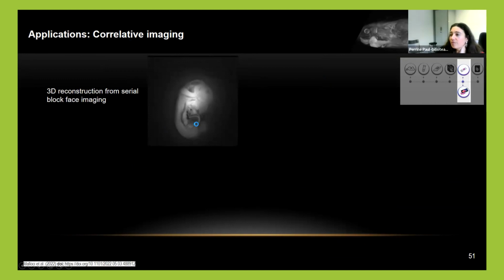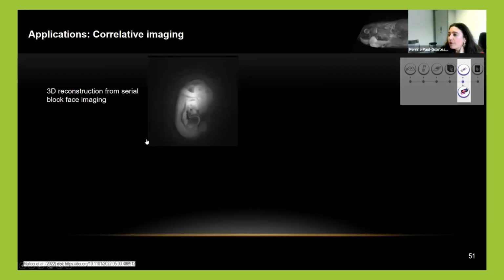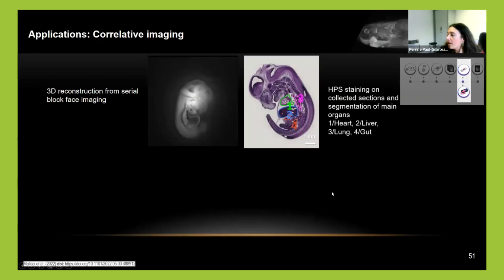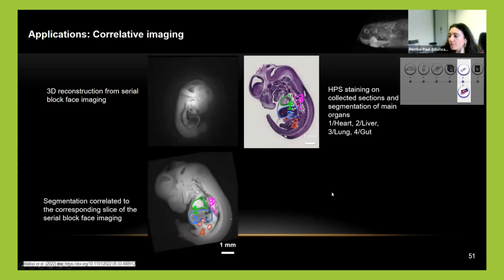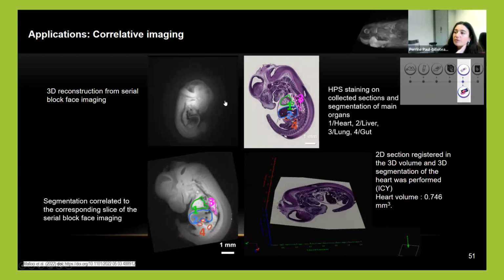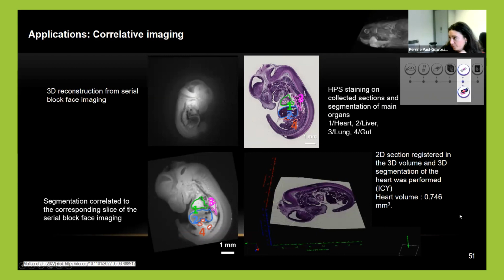Here are some different examples from an embryo. You get some example of images of an embryo, and because you get the slide directly from the image, you have a direct matching that it's easy to do, using ECCLEM also, and then the slice is correlated directly with the 3D dimension.